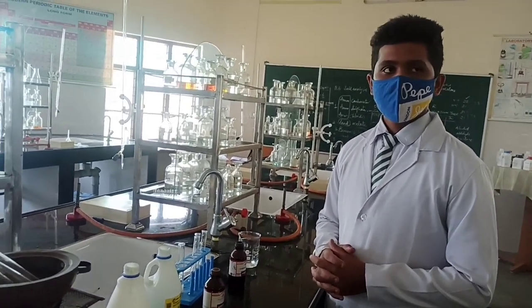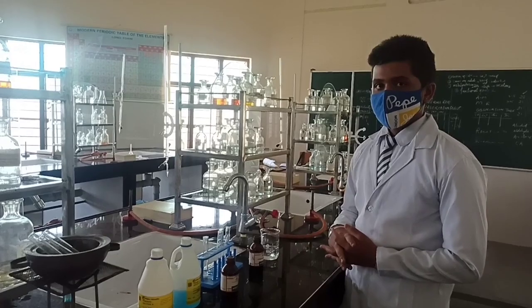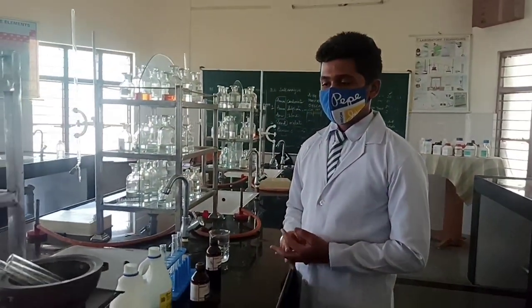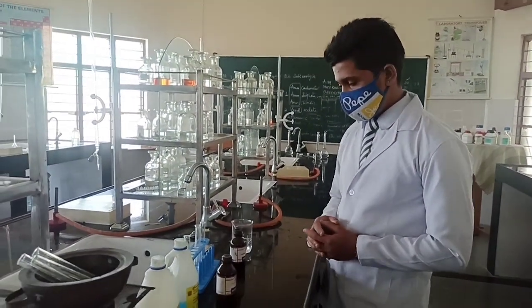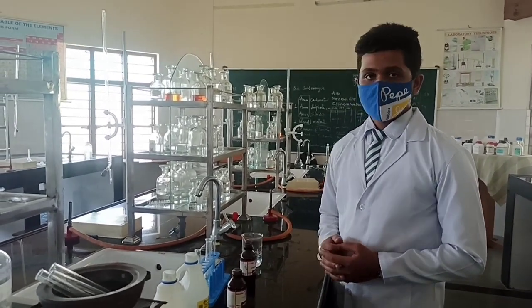Today we will be testing for the presence of aldehyde. For aldehyde we have three confirmatory tests. The first is Schiff's reagent test, second Tollens test, and Fehling's test.